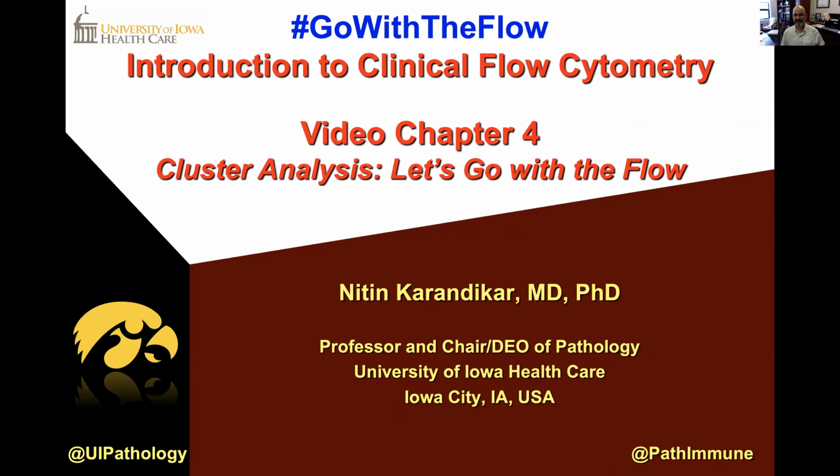So let's get to it. At the end, we are going to do some cases, where I will analyze them in front of you. And maybe we'll leave with a case as a quiz, which you can then answer either down here in YouTube, or if you found this through Twitter, then you can answer the quiz in Twitter.